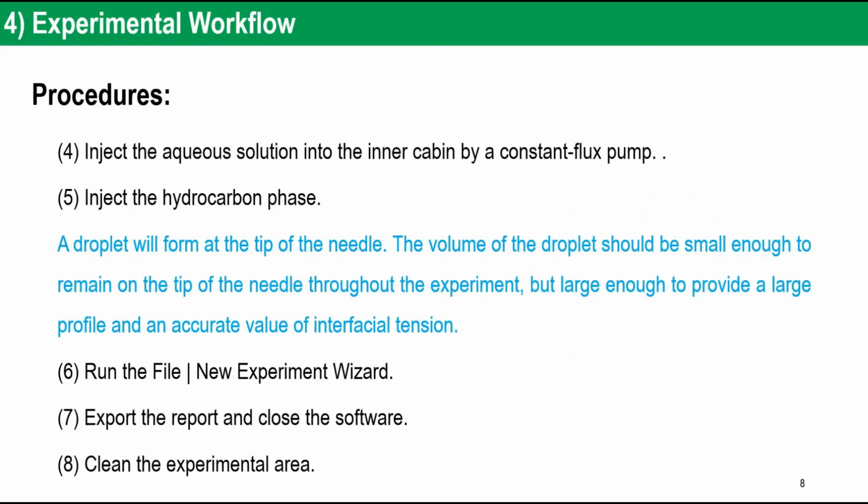Fourthly, inject the aqueous solution into the chamber using the constant flux pump and check the aqueous level to ensure the later injected hydrocarbon droplet can be fully immersed.